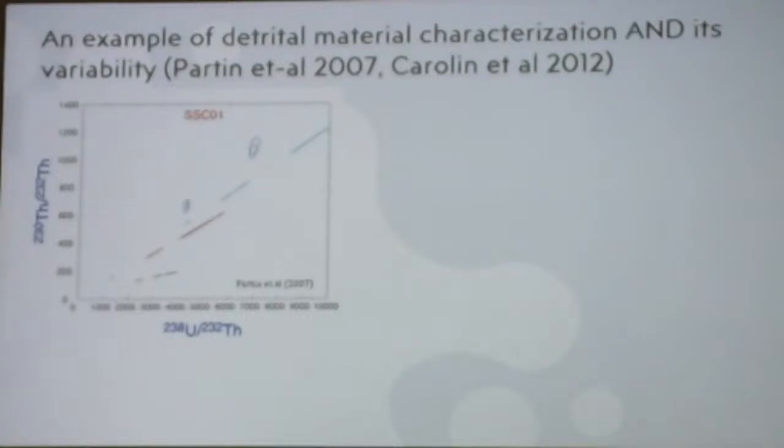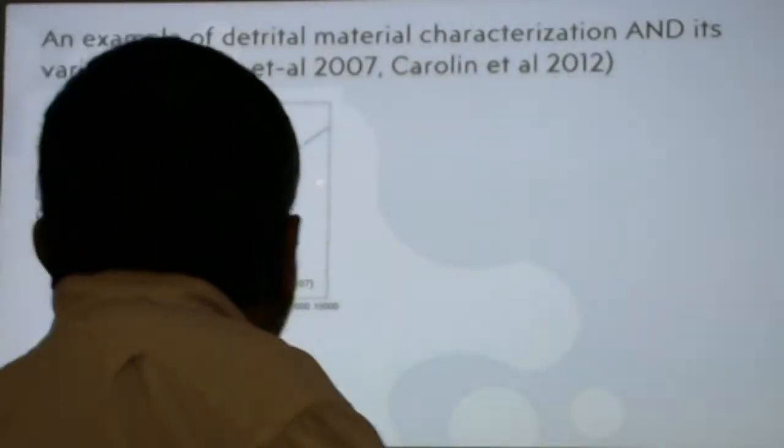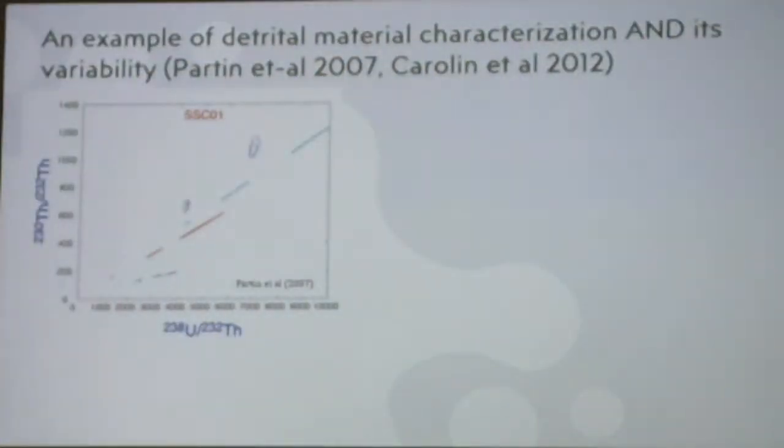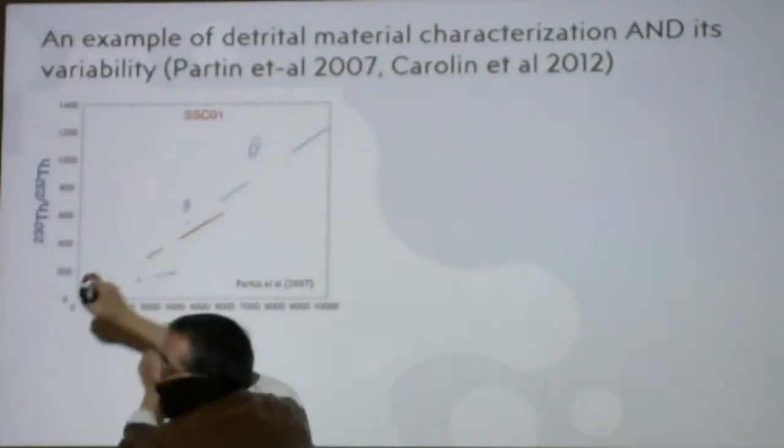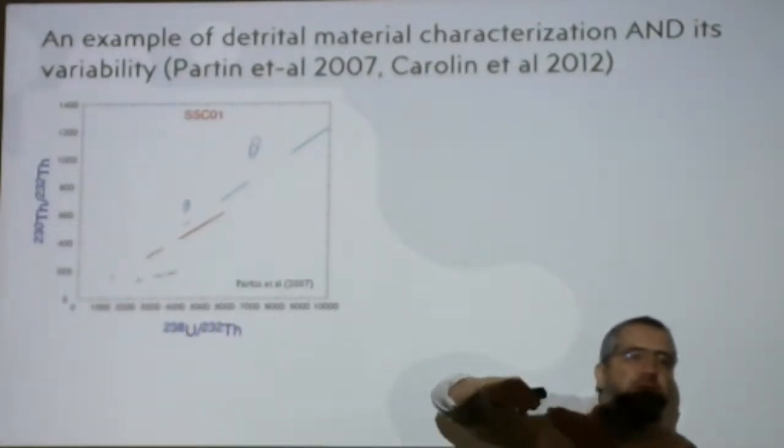So these are the Rosholt isochrons. What you're seeing here is the data from Partin. And you don't see that these activity ratios are plotted as a cross or an oval, something like that. They actually look basically like a line. If you look at it very carefully, you'll see that these are extremely elongated ovals, really, really long ovals, and they are tilted.